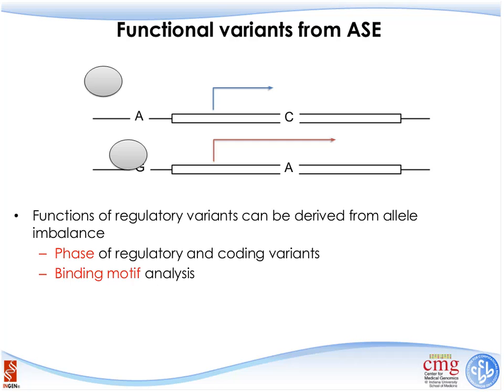And in order to do this, there are two different approaches that we need to take, and we need both. The first one is, in order to know which allele in the promoter region or regulatory region is in the same haplotype with the coding allele, we need to first phase the regulatory and coding variants. We need to make sure, in this case, that A in the promoter is corresponding to the C in the coding region. Otherwise, we may not be able to do the study in a very meaningful way.